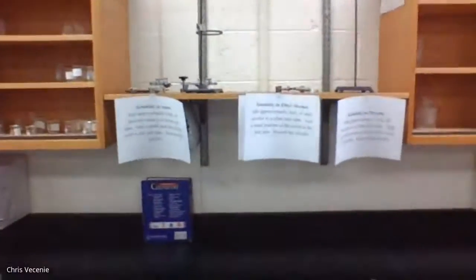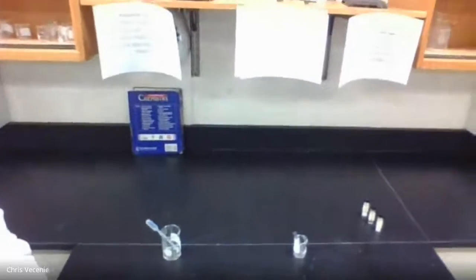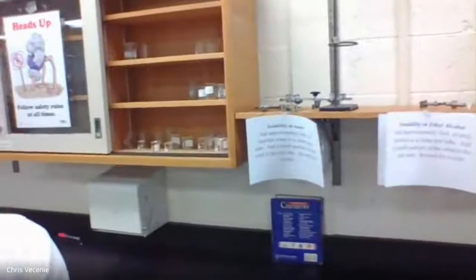Come over here, and then this would be what we call our solubility station. I would have 3 different beakers that had water, ethyl alcohol, and hexane in them. You would take 2 milliliters of each of those out, and you would see, can I get my solid substance to dissolve in that? So we're running a bunch of tests, over and over again, to see if we can figure out what the bond type is.